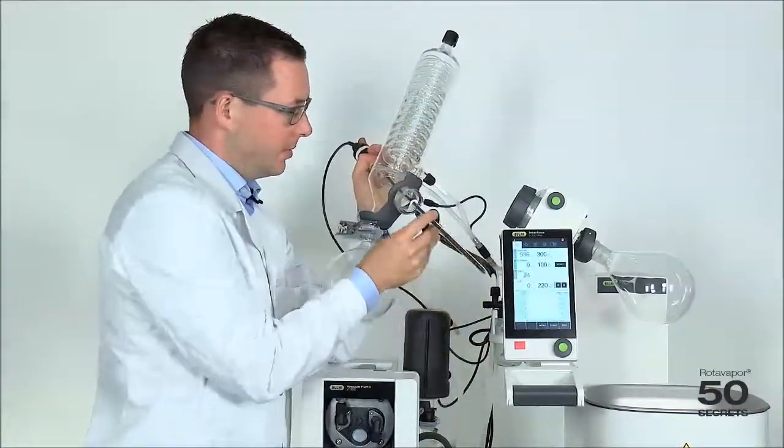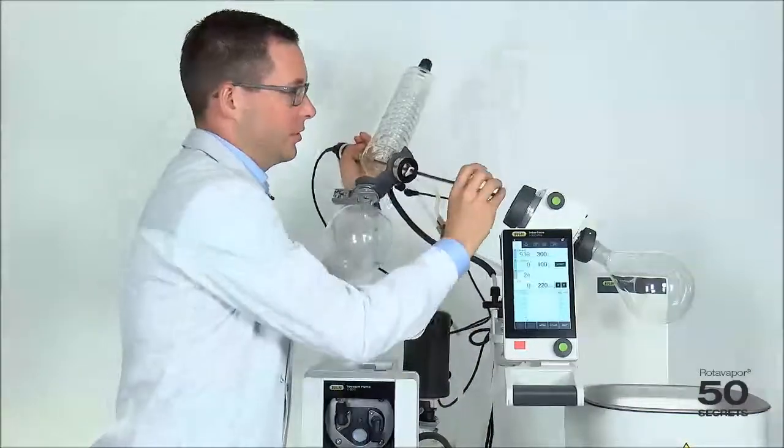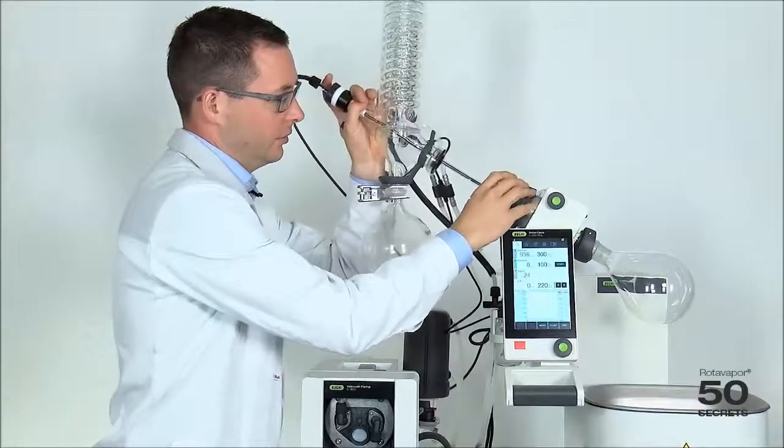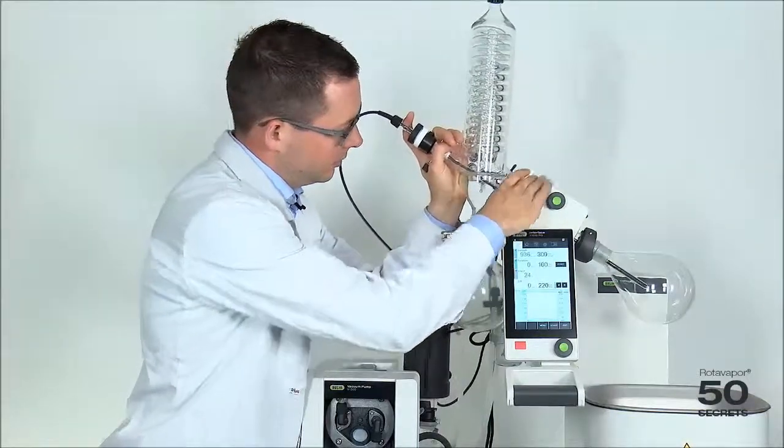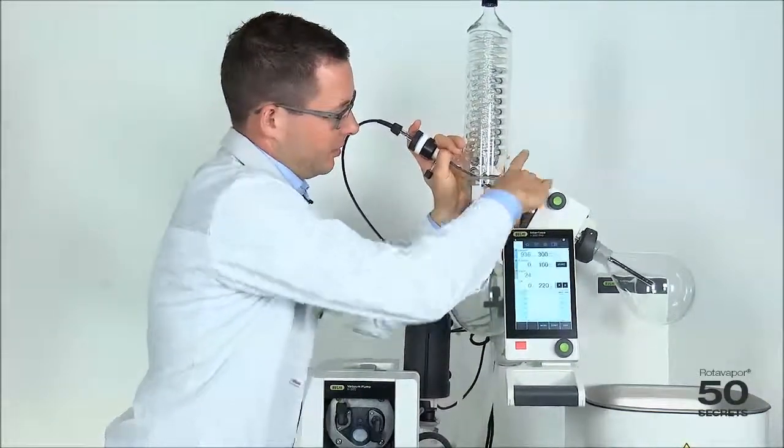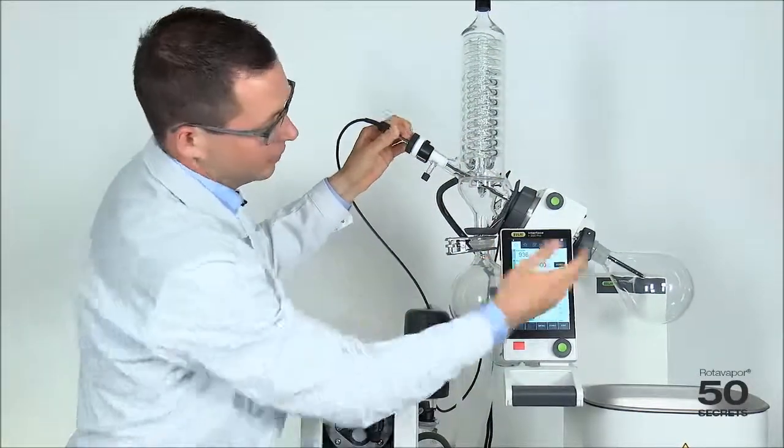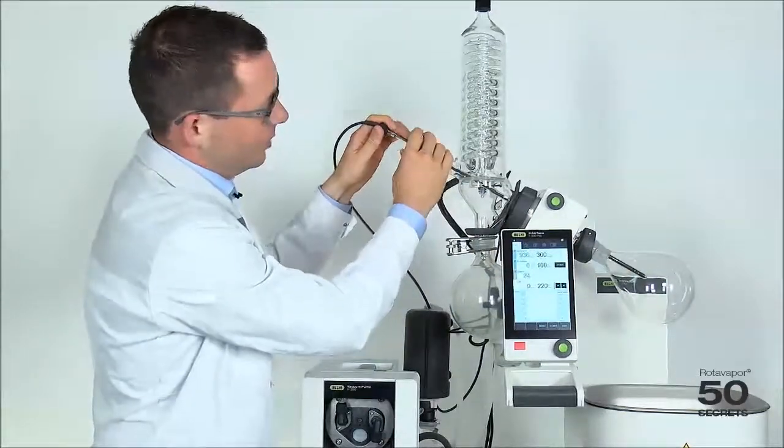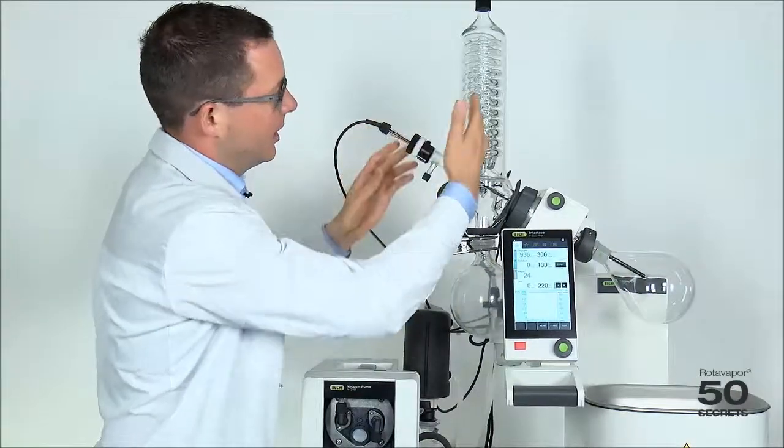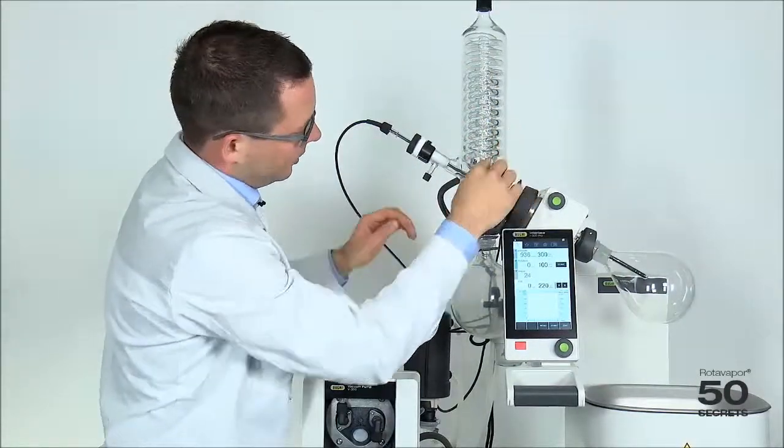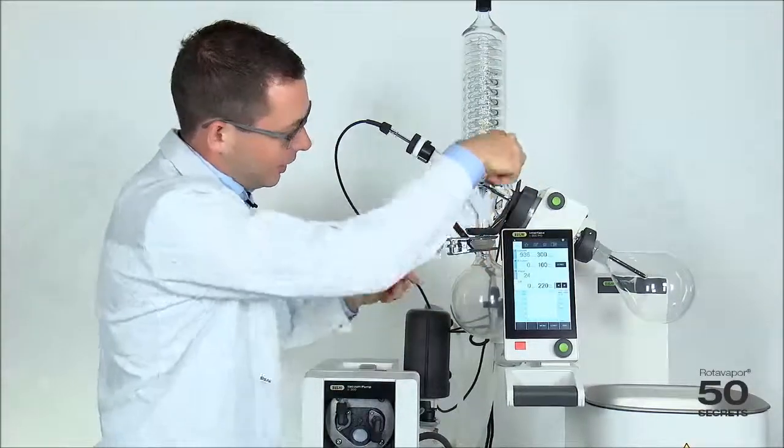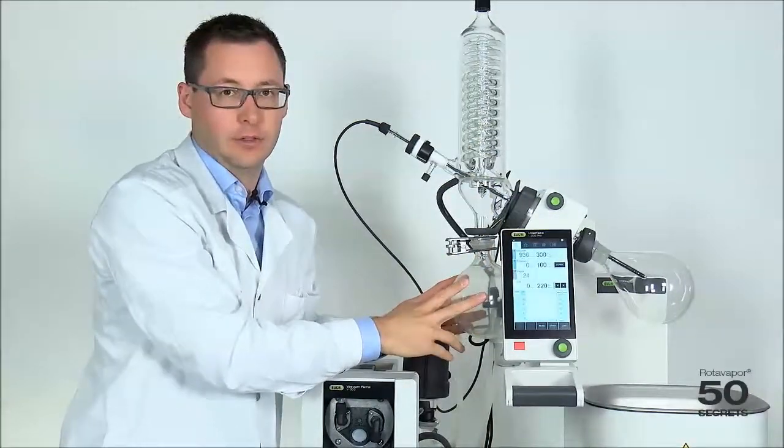We put the sealing back on. We insert this back into here like that. We tighten and now we can move this up just slightly so we have the right position. We fix it and now all the droplets which form will go to the drain disc and then drop down into the receiving flask.